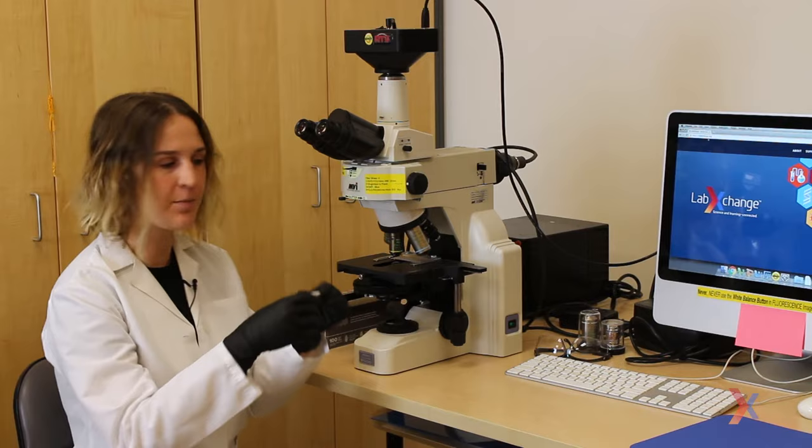Hello, today we're going to learn how to do fluorescence microscopy. We're starting with a slide that has some cells on it that are in a mounting medium with a piece of cover glass sitting on top.